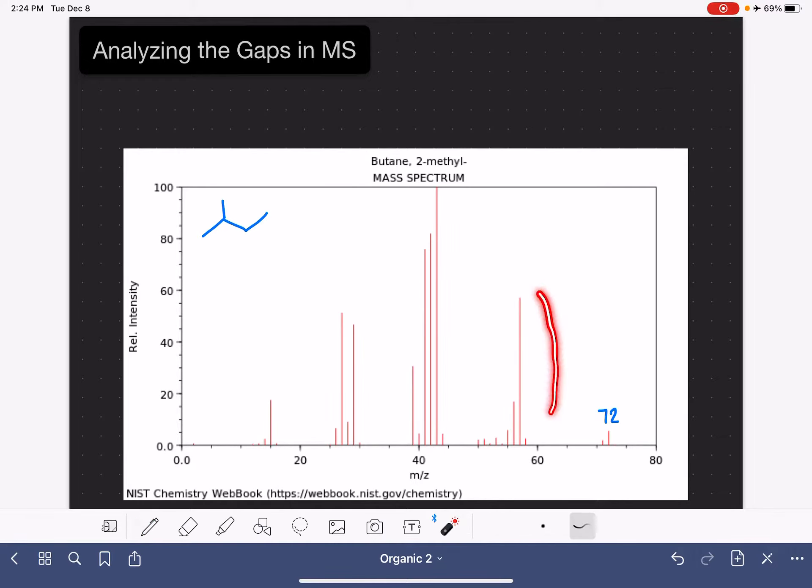I'm also going to be looking at clusters of peaks. Here I have a little cluster of peaks, and I'm just going to focus on the most abundant or the most prominent peak within that cluster. That peak looks like it is at 57.